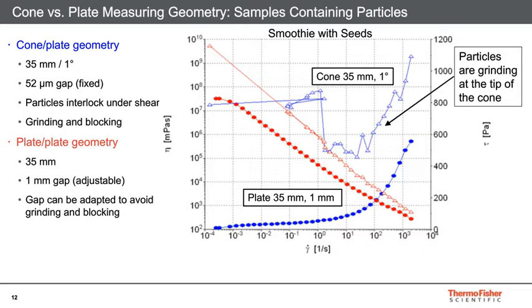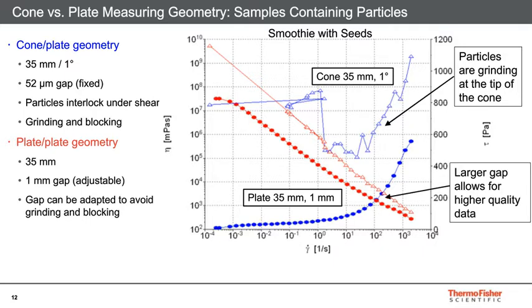So always remember, if you have a sample with particles, always consider the maximum and the average particle size, and make sure that you select an appropriate geometry to measure that viscosity.